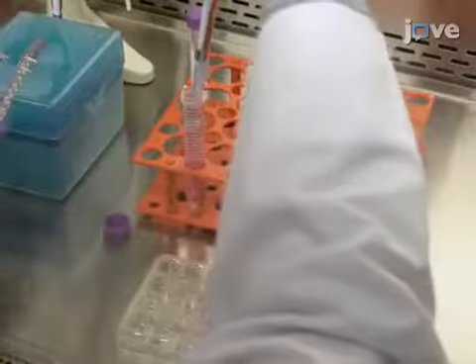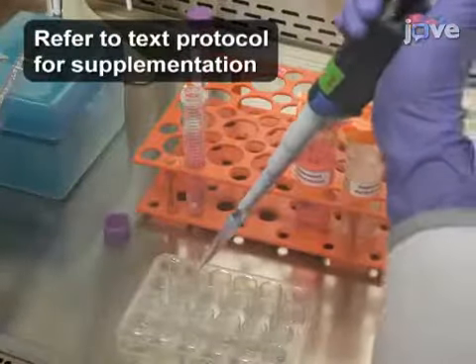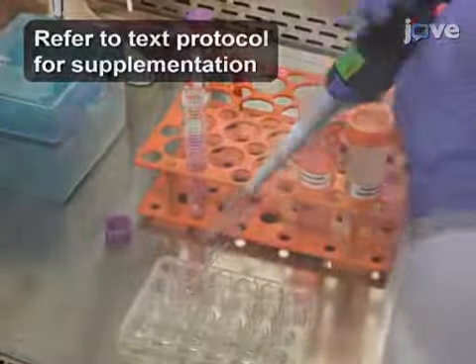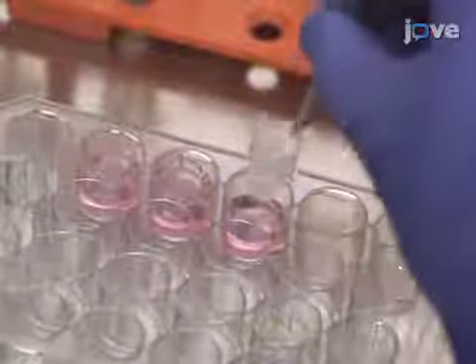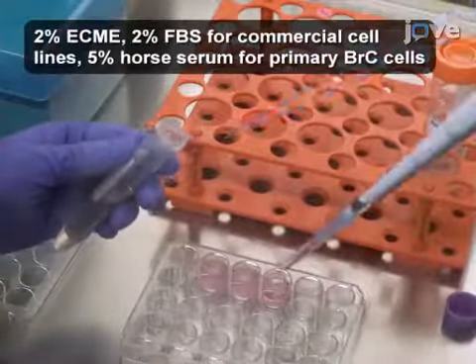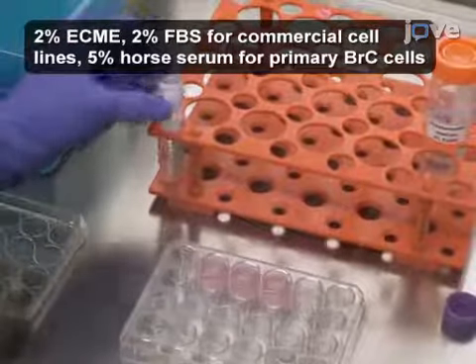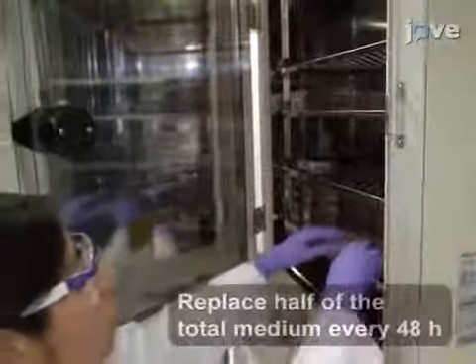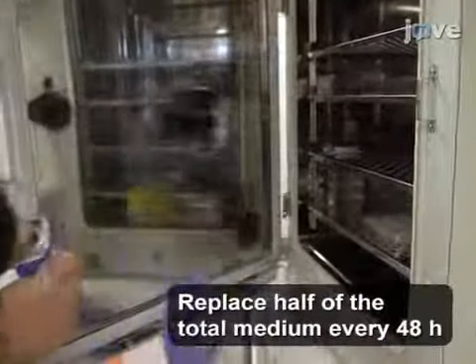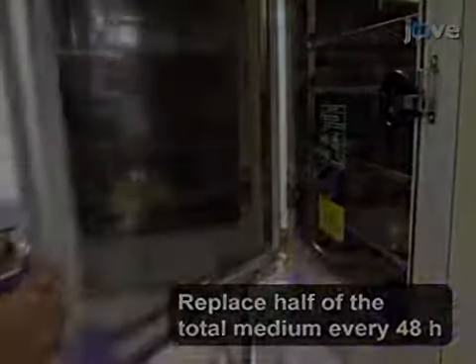Plate 4 × 10⁵ monocytes in 1 milliliter per well of their corresponding medium. Place an insert in each well and add 900 microliters of the 4 × 10⁵ BRC cell suspension in the corresponding medium. Incubate the cultures at 37 degrees Celsius in a humidified 5% carbon dioxide environment for 5 days and recover the supernatants.